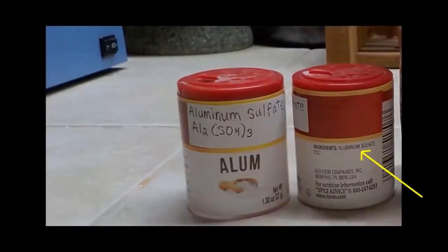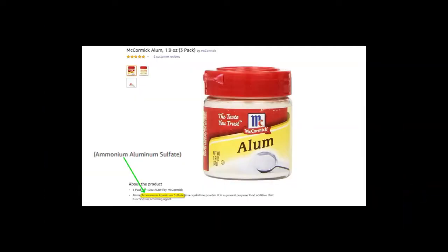One ingredient you will need is aluminum sulfate. Look in the spice section of your local supermarket for alum. Check the ingredients — this one states that it is aluminum sulfate. Here's one that is ammonium aluminum sulfate; you don't want this one.